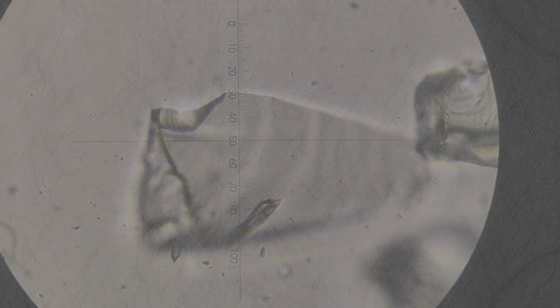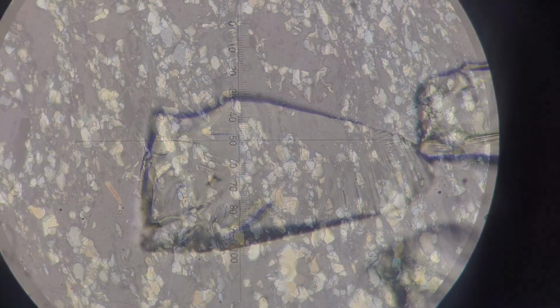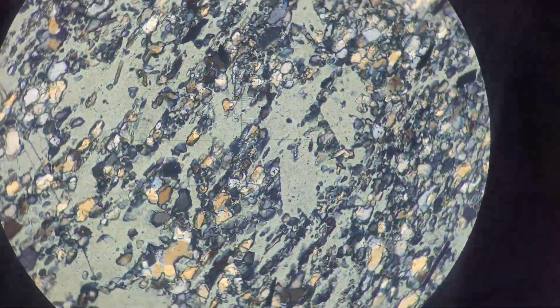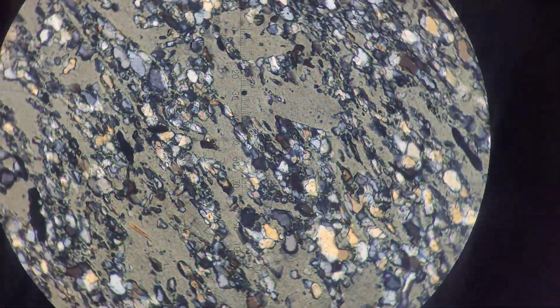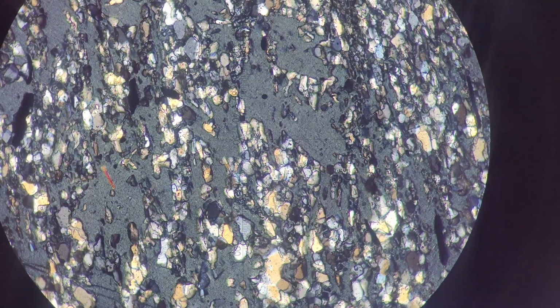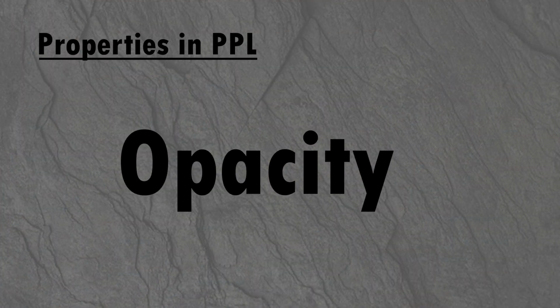There are 2 main types of sample preparations. There's the grain mount, where individual grains are sealed within a mounting oil, and the thin section, where a slice of rock is epoxied into the slide and ground down to a thickness of 30 micrometers. The first property in plane polarized light is opacity.